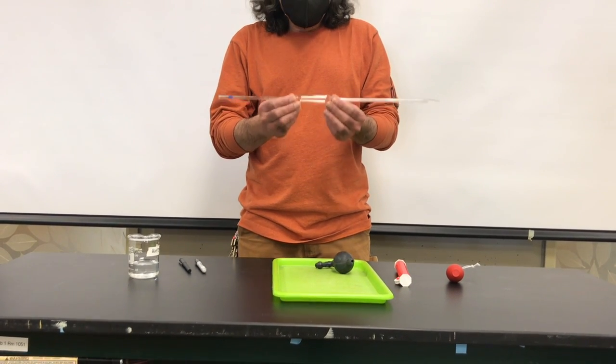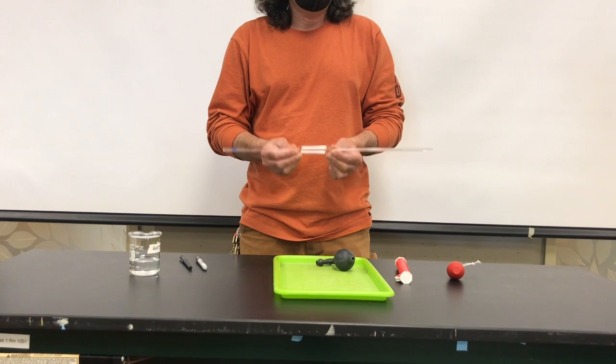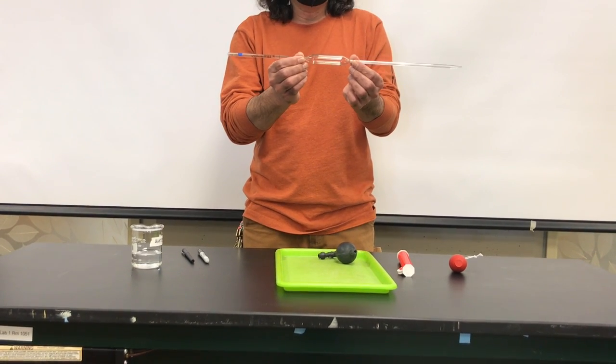To make accurate measurements of liquids, often times you're going to be using what we call volumetric pipettes, like this one.